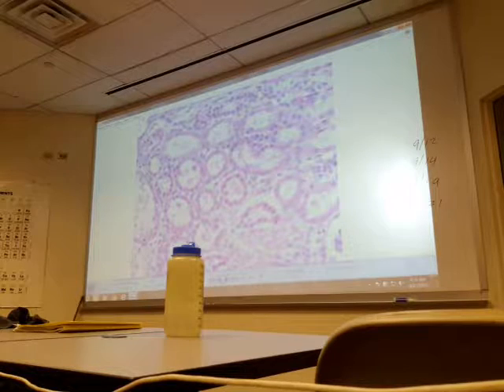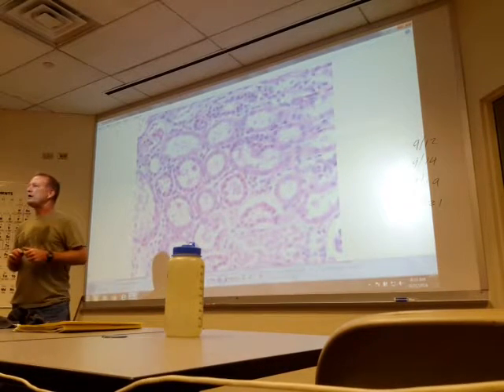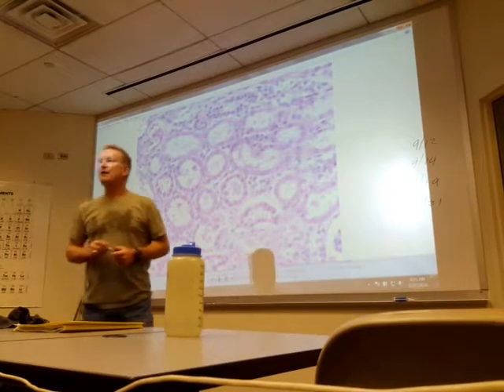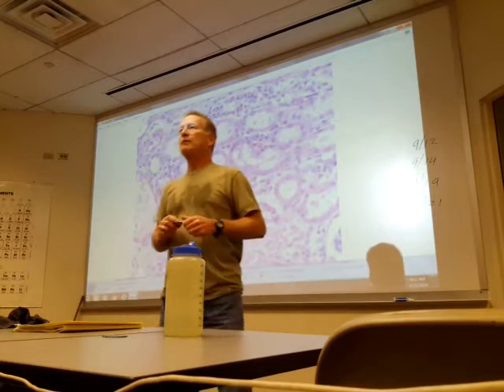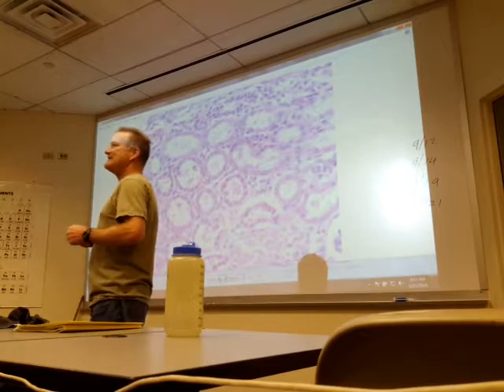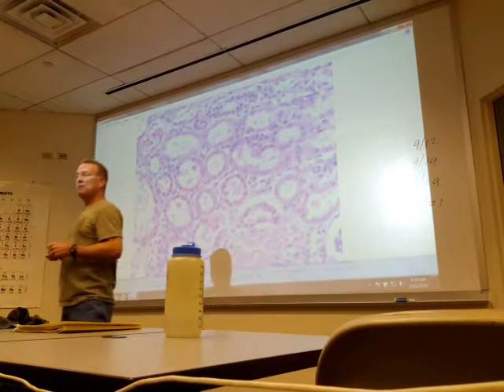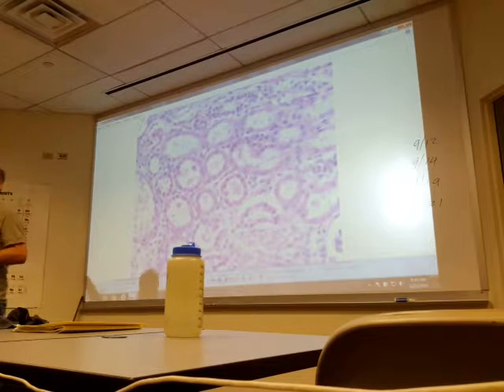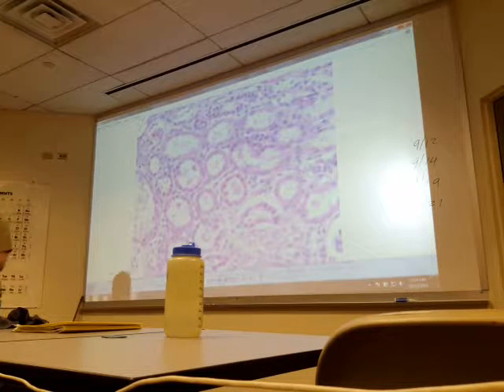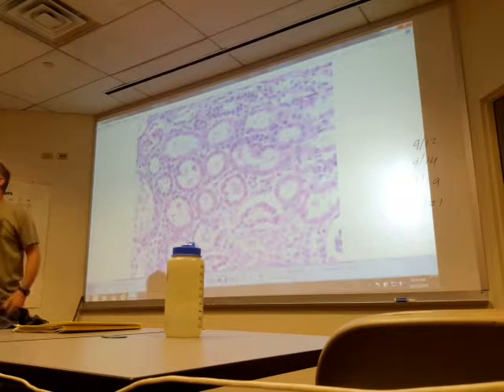You wouldn't want to start with a high magnification. You wouldn't have any perspective. It's kind of like if we're traveling to Daytona, leaving from Colorado and driving. We're not going to start with a map of Daytona, are we? We're going to start with a map of the United States, because we've got to decide how we're going to get to Florida. We may go up to Limon and get on I-70 and head out across Kansas, Missouri, and then go south, or we may go south and cut across Texas and Louisiana. How are we going to get there?